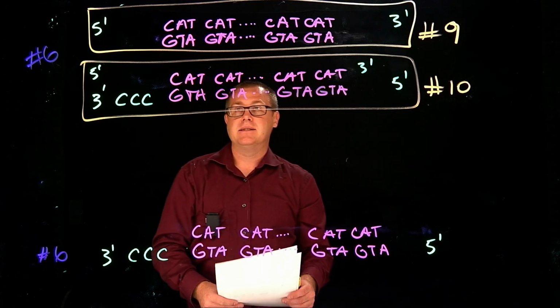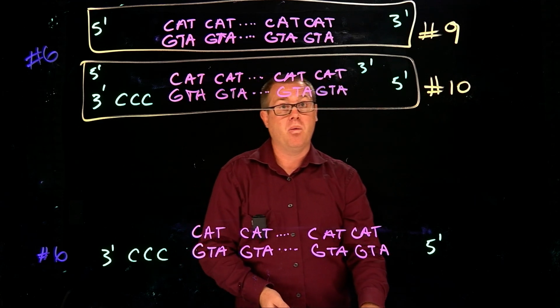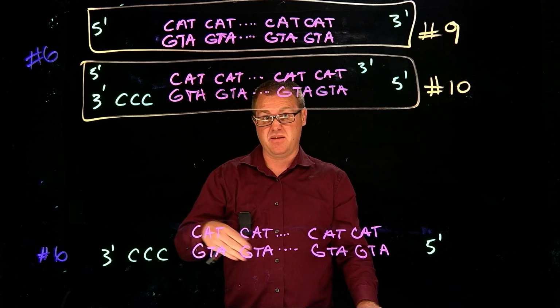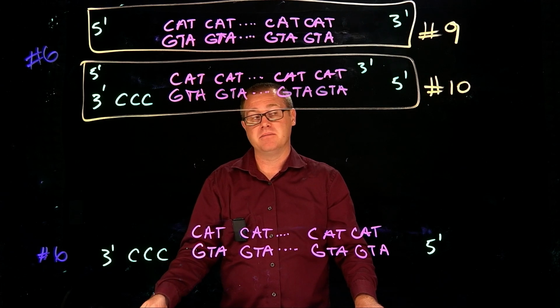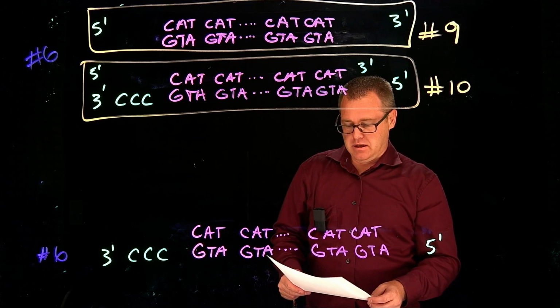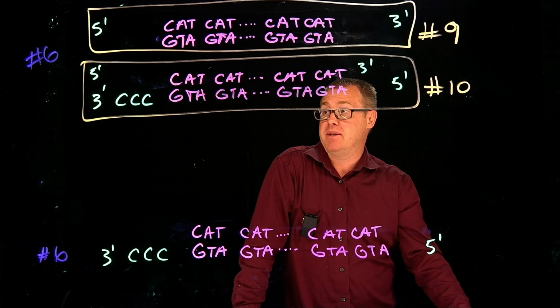But the idea is that once you get molecules with at least one of the strands with no green or DNA that you don't want that's attached, then within 25 to 30 cycles of this process, you're going to get millions upon millions of copies. Well, let's just say millions of copies, okay? Lots and lots. Okay? So that is PCR, and that's how you're going to just replicate a lot or make many copies of your DNA.